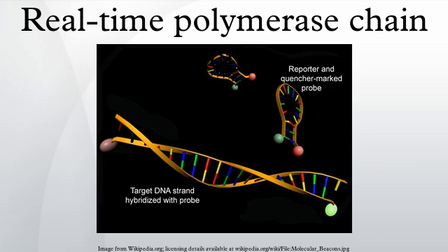However, the most crucial aspect of the process is that the reference gene must be stable. The selection of these reference genes was traditionally carried out in molecular biology using qualitative or semi-quantitative studies such as the visual examination of RNA gels, northern blot densitometry or semi-quantitative PCR. Now, in the genome era, it is possible to carry out a more detailed estimate for many organisms using DNA microarrays.